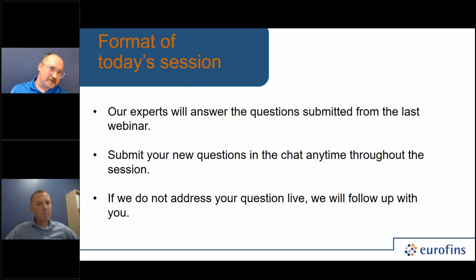Again, it goes back to the same principle that you need the concentration to be high enough where we can dilute out to get a clean sample that doesn't have that interference that we're speaking of. But we've tried all sorts of things. We've tried granola bars, with a yogurt coating on top of it. I could say those are particularly challenging. But if you could think of it, we've probably at least tried it by flow cytometry.